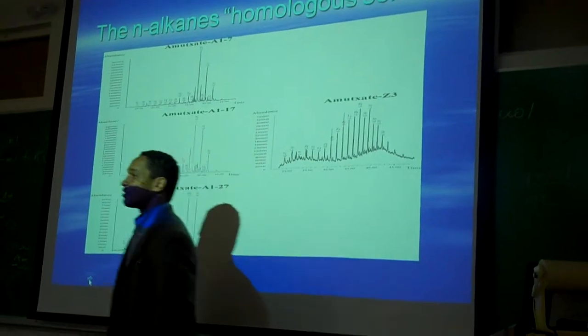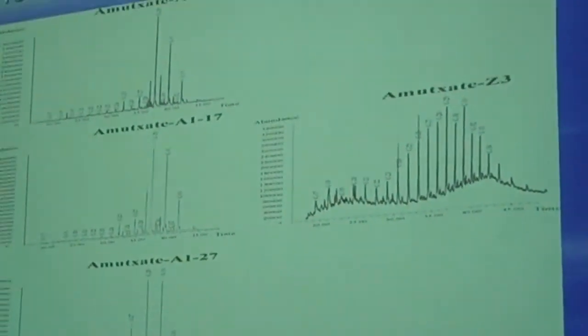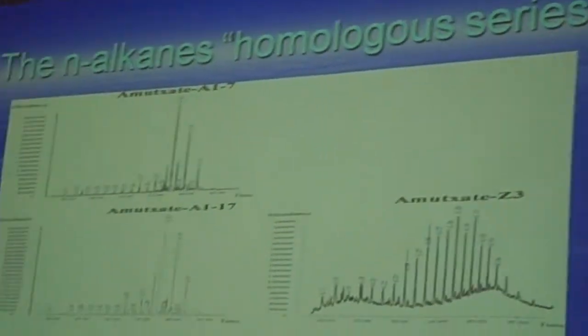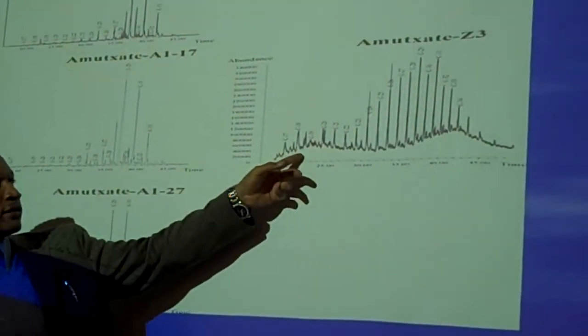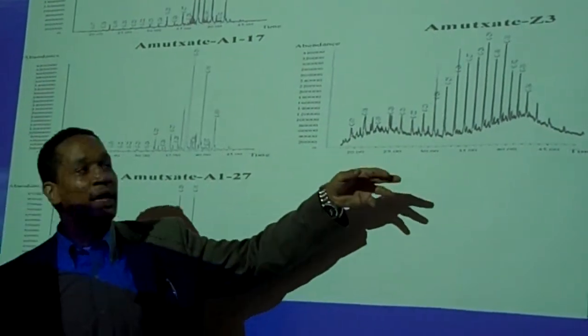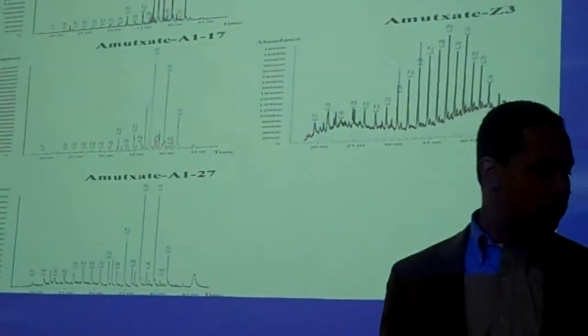This is something that I did. Okay, so I found the spectrum. These are homologous series. So when I had instrumental analysis, let's say this is ethane, what's next? Propane, butane, and this is the homologous series, the chromatograms of the homologous series.